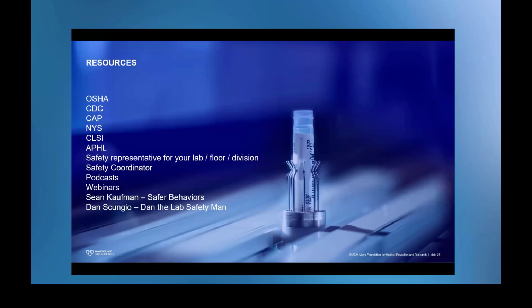We are very fortunate here at Mayo in Rochester. We have what's called a high consequence infectious disease laboratory. It is supported at the institutional level. So we have a nursing specialist who trains those from lab and those from nursing on the appropriate PPE to be worn, and then annually doing fit checks for respirators, but PAPRs are an easy just-in-time training to do.